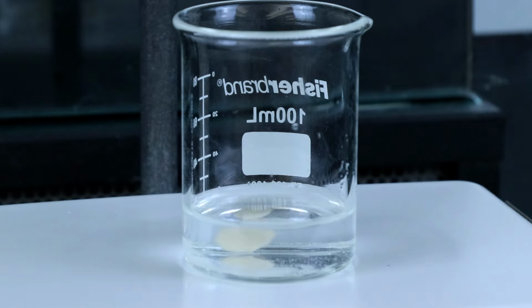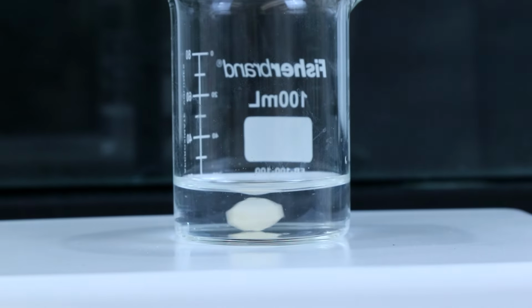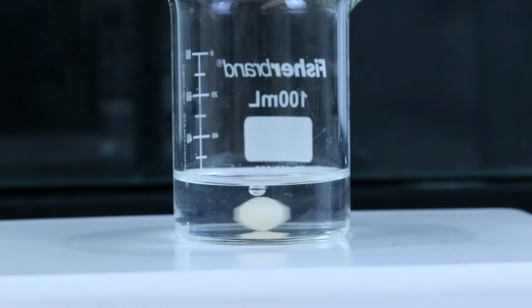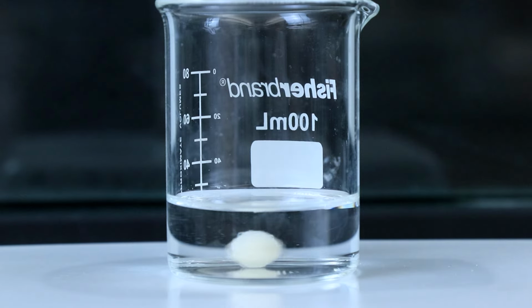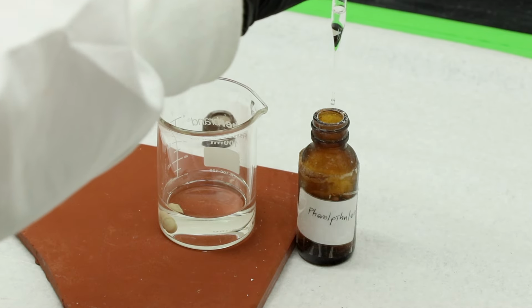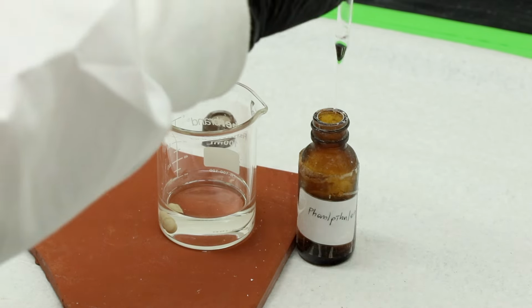that solid. And although it was super soluble in water before, it seems like it's not quite there yet, so I'll add a little bit of ethanol to help. But eventually it looks like it did fully dissolve in that water bath. I'll make sure to add the phenolphthalein indicator so that we know when the titration is done.